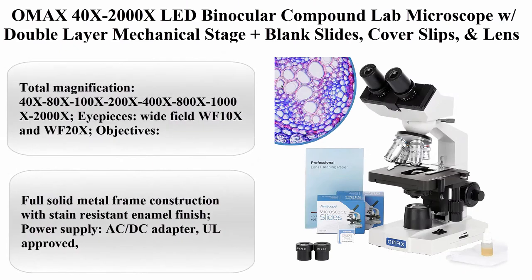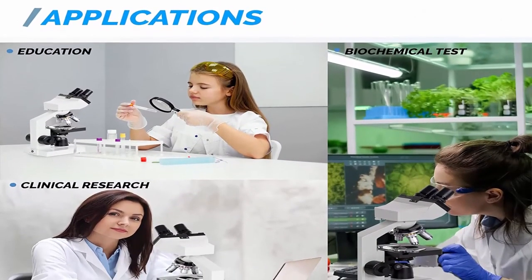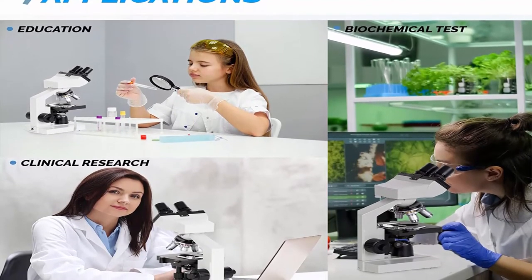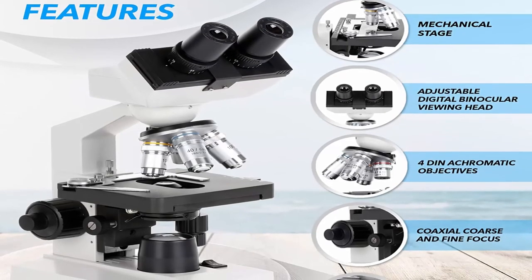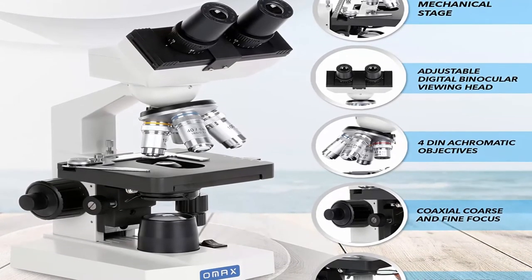Top 5: OMAX 40x–2000x LED binocular compound lab microscope with double-layer mechanical stage, plus blank slides, cover slips, and lens cleaning paper (model M82DSSE-100LP100). About this item — total magnification: 40x, 80x, 100x, 200x, 400x, 800x, 1000x, and 2000x.